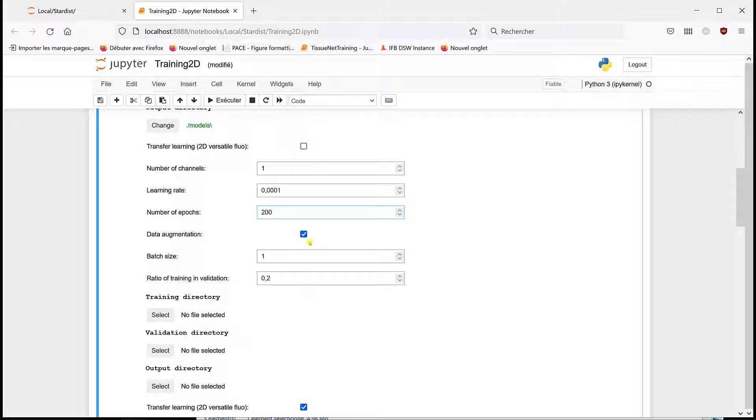It's not coming the same way than with the U-Net. It's going to apply randomly data augmentation to the images, and it will always help to have some data augmentation at least. I would really suggest to add that augmentation.